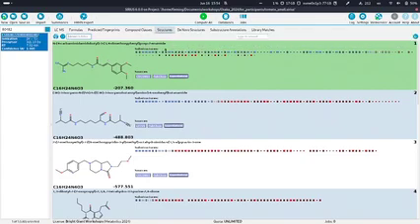Especially now that I'm showing all these different views, it's important to remember that usually when you run SIRIUS, you are not looking for only one score or one very specific thing, but you have many very different views to look at your data, and they can all give you indications on what might be the correct structure or correct information on what you have measured.